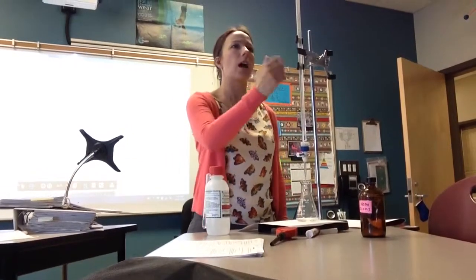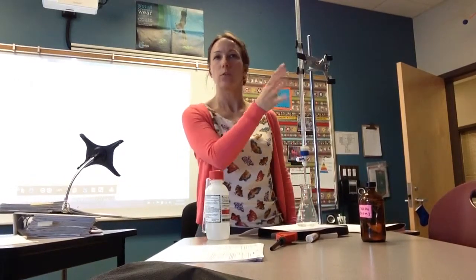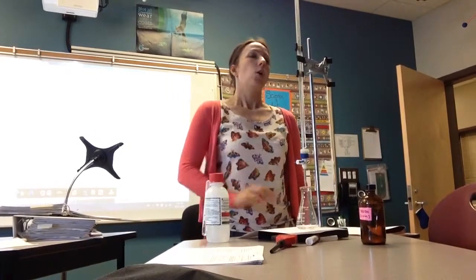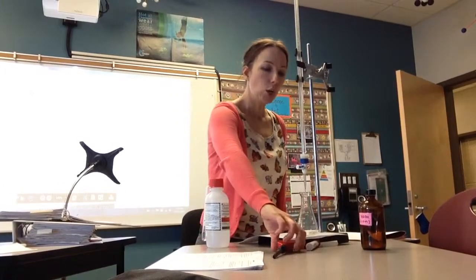And you had to do it 3 times because you're not so precise with this endpoint pink, light pink, dark pink. So therefore you do it a few times until you take the average and get a nice calculation. Everybody remember this? Chem 30 is about exactly what's happening here. Okay? So in here I have my sodium hydroxide.